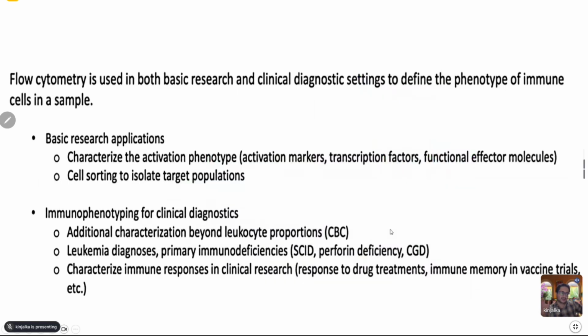So with this, we will summarize that flow cytometry can be used both as a research tool as well as a diagnostic tool. It has a lot of applications. There are different kinds of flow cytometry that are used: flow cytometry, spectral flow cytometry, imaging flow cytometry, mass cytometry, and so on. You can also use flow cytometers for sorting. You have Luminex based platforms where you are multiplexing and doing more and more antigens.